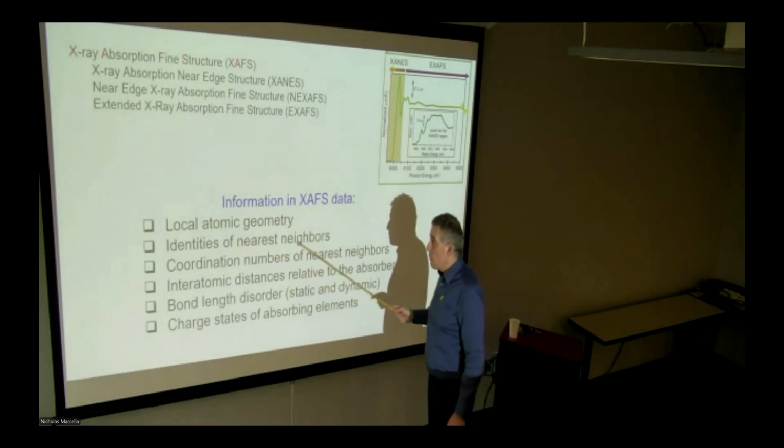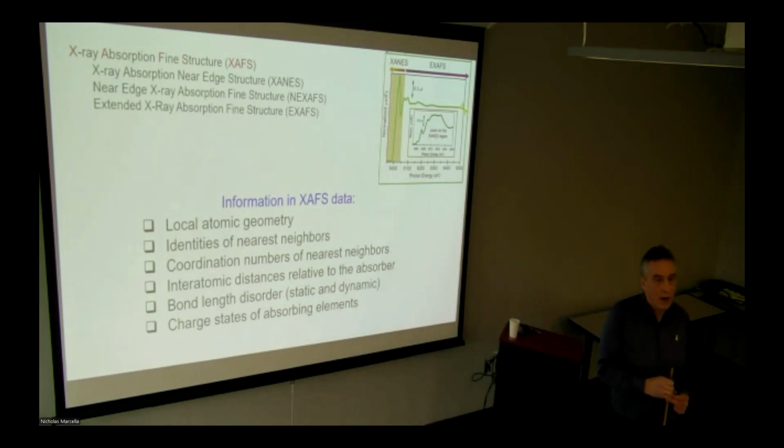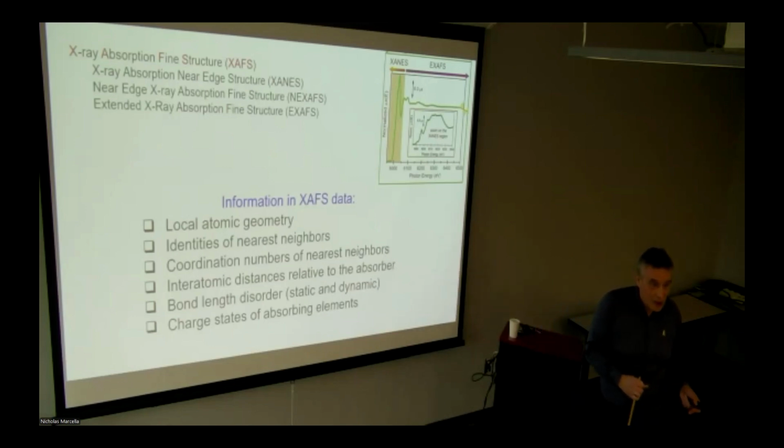Now, another question, maybe more difficult to answer, is why do we know from XAFS whether our neighbor is, let's say, the same element or another? Can we use it for understanding the composition of alloys, which contain different elements? Or will all alloy components look identical to XAFS, so it will not be possible to say whether it's just palladium all around, or a palladium gold alloy, if you do palladium XAFS? Who can suggest an explanation? Well, the answer is yes, we can, but why?